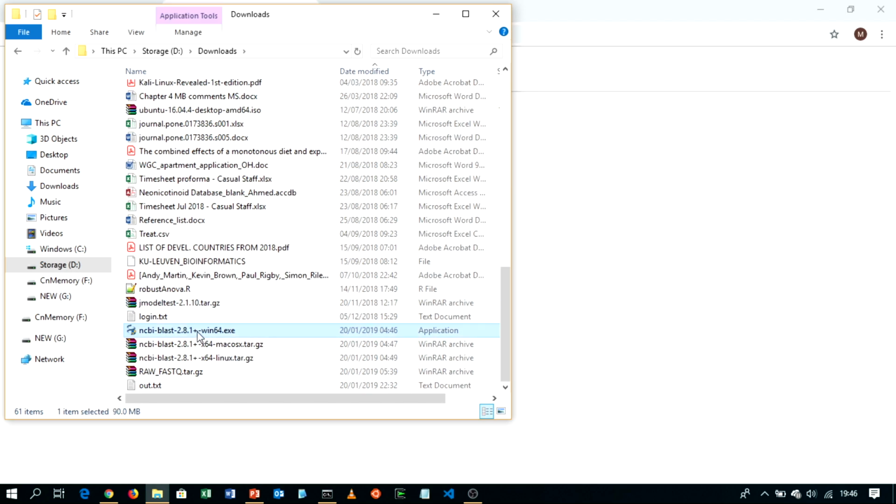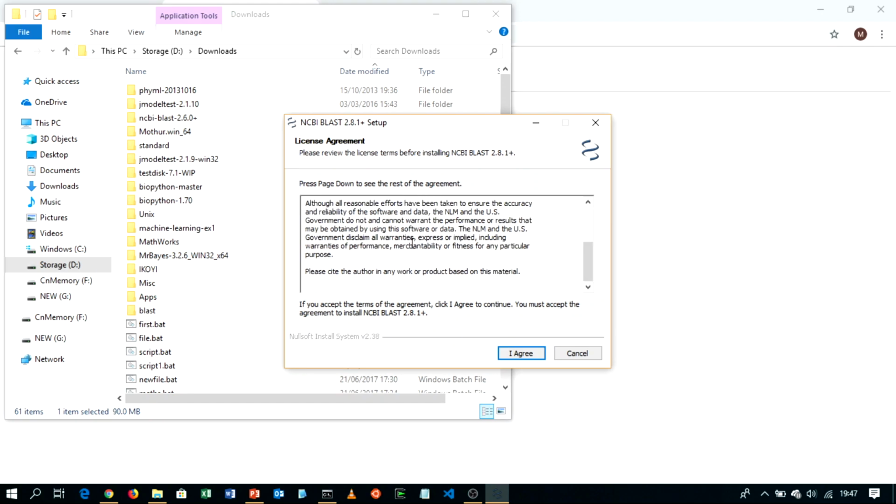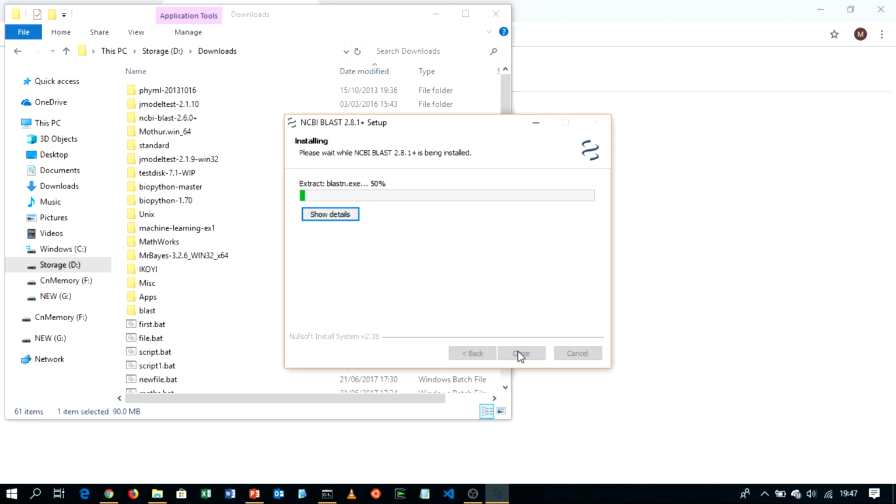So this is it. To install it, all you need to do is double click. We say yes. Agree and install. You can close now. It's complete.